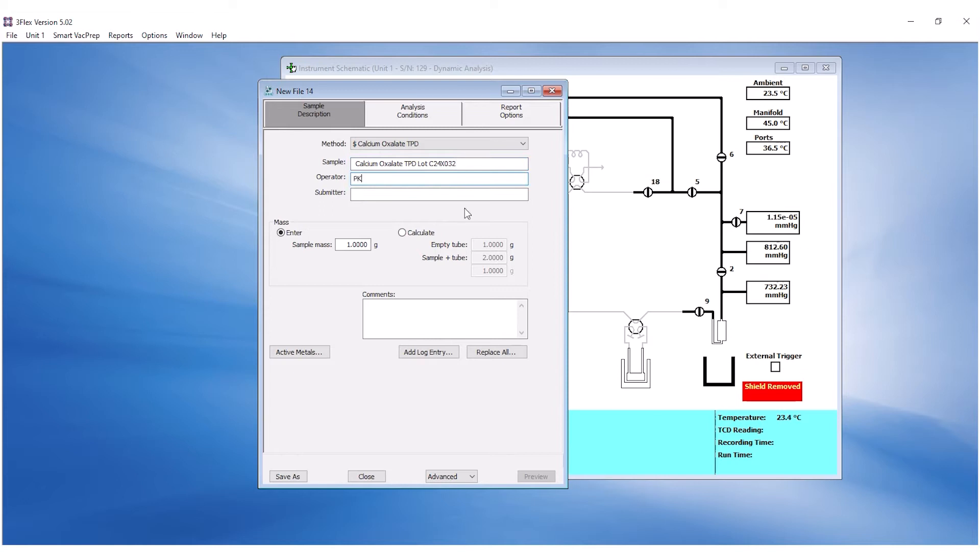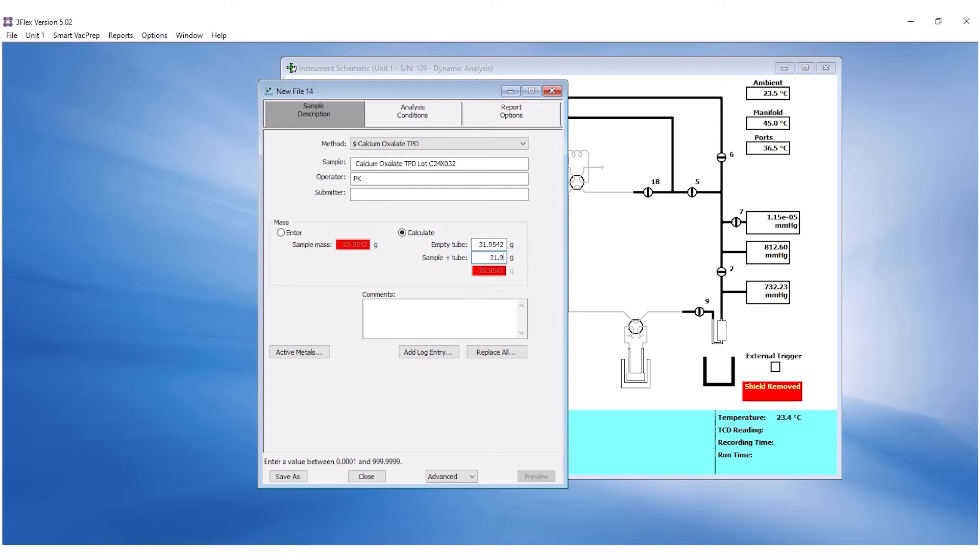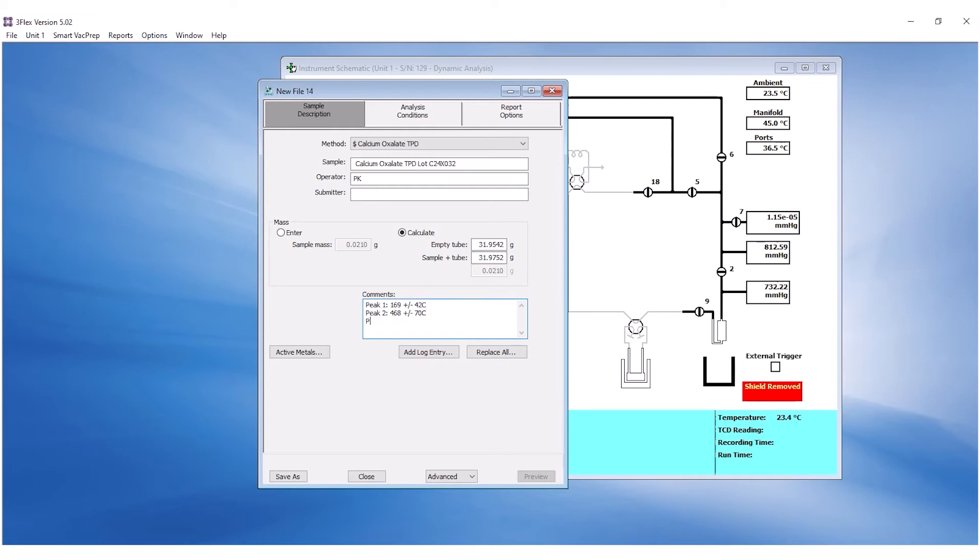Select Calculate for the masses and enter the empty and sample plus tube masses. The before analysis mass should be used for the sample plus tube mass. Under the Comments section, enter the temperature specifications of peaks indicated on the reference material manual.